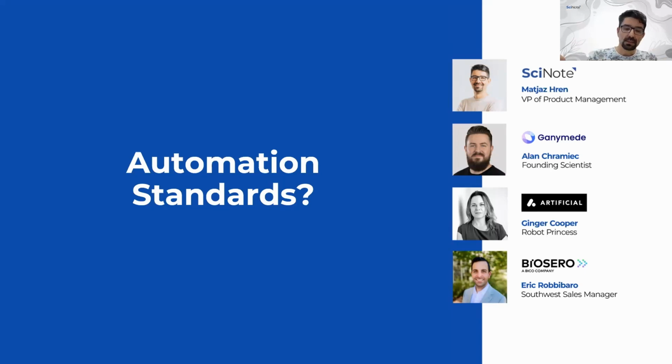And in addition to the standards that I mentioned before, they add some additional values, whether these are plugins with the LIMSes, ELNs, whether this is workflow building or orchestration, or already some data visualization or data analytics, data warehouses. So it's not just about data standardization.